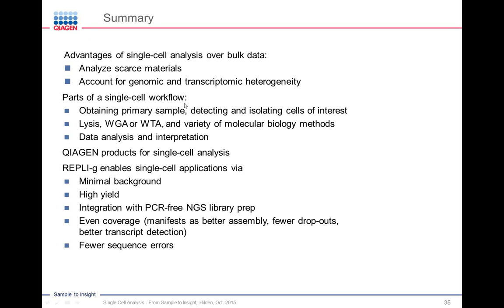When you're setting up a single cell workflow, there are a few things you need to consider. For the most part, the molecular biology and data analysis that you do downstream will be very similar to as if you were doing a bulk sample. What you need to give extra attention and extra care to are the method of isolating single cells, especially if you're coming from a solid tissue where tissue disruption may extremely change the transcriptome profile of your cells, and the method that you're using to amplify the DNA or RNA out of that, because this is setting the stage. After this point, if you've screwed this up, there's nothing you can do to rescue it downstream, because that cell is gone.